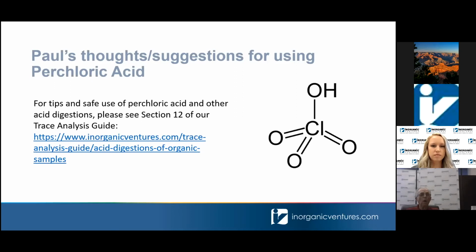So my general rule of thumb is, if you have access to an infrared spectrometer, do an infrared scan of your sample types before you try to digest them. If you're going to use this kind of digestion, make sure your functionality is safe. It's sometimes hard to tell if an alcohol is there. I look for the carbon-oxygen stretch on the primary, secondary, or tertiary alcohols.